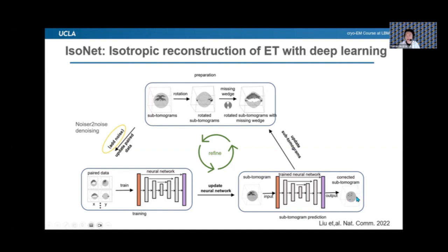This is one step, but during the training, the ground truth is not actually ground truth. So we use the corrected tomogram and add it back to the original subtomogram. So this is added to the original subtomogram, and with the added-back information, it looks better. Every time it looks a little bit better for filling in the information.